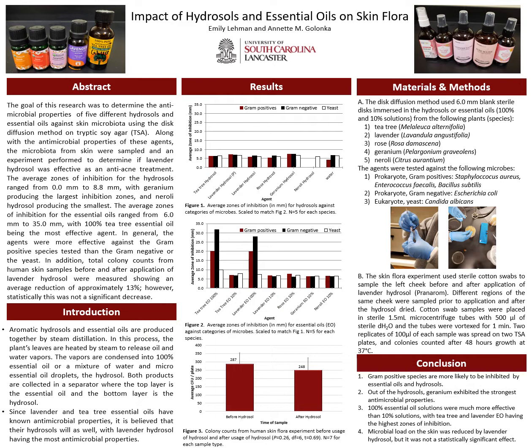But then I had to understand also that these small zones also showed something. It showed that they didn't have antimicrobial properties, and this is useful information for these manufacturers that make it, that say they don't have FDA approved statements. And this is an experiment, obviously I'm not the FDA, but this is an experiment that shows that maybe some of the things that they're saying aren't as true as what they should be.